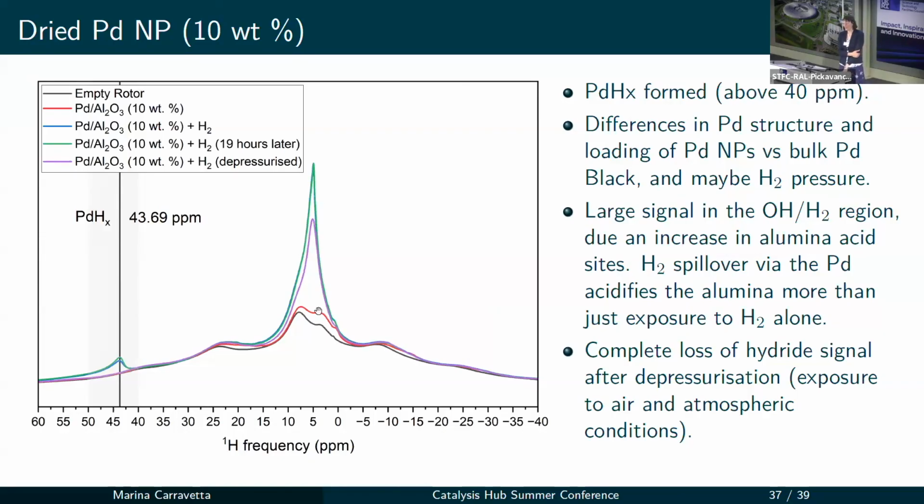No, this is the very latest piece of work, because we only managed to get this piece of equipment back in operation a few weeks ago. But there is quite a lot to do, and we are ready to explore various directions. We definitely want to follow the pressure effect. We want to follow if there is any temperature effect, because all of this is happening at room temperature.